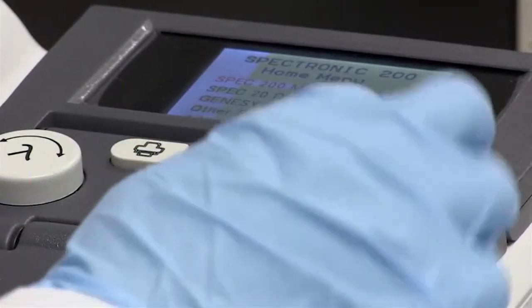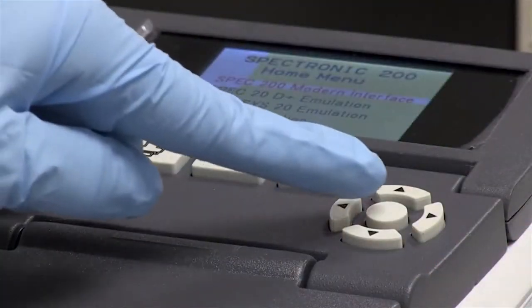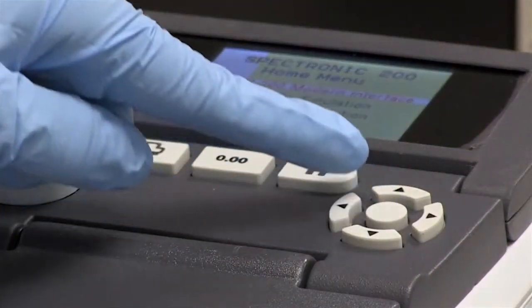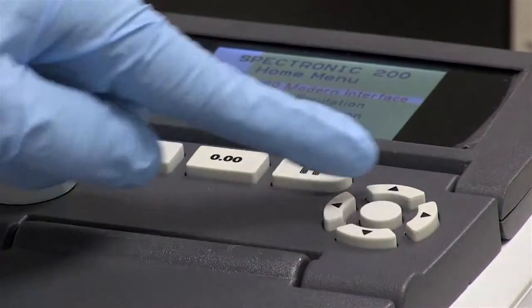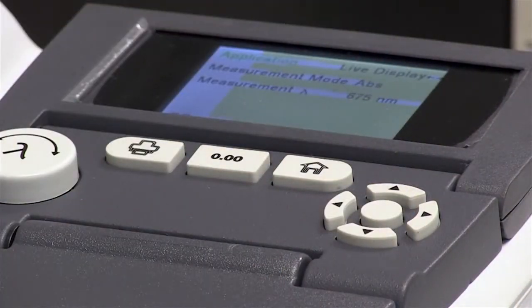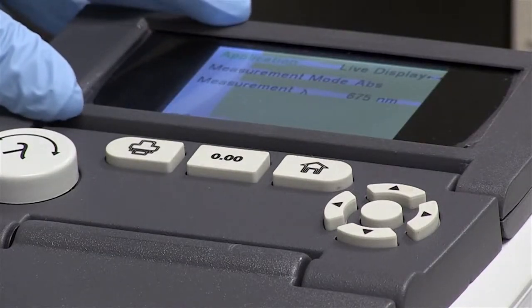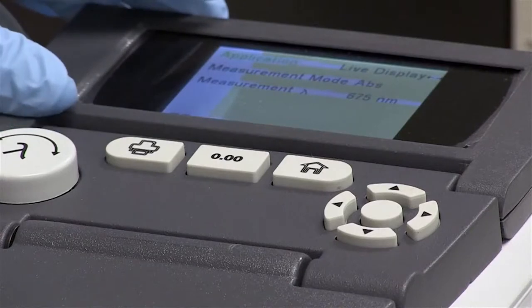Our enter button is actually this circular button in the center of the arrow buttons. So we press that and it gives us this display, and we are going to be measuring in the live display mode.